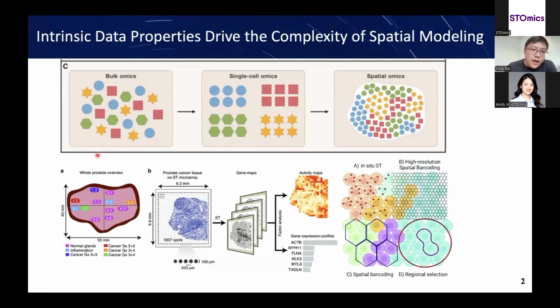However, most of algorithms just simplified this calculation into 20 to 30,000 genes, and each gene has only one dimension. So for one-dimensional analysis, 10 replicates would be sufficient to get robust statistics.